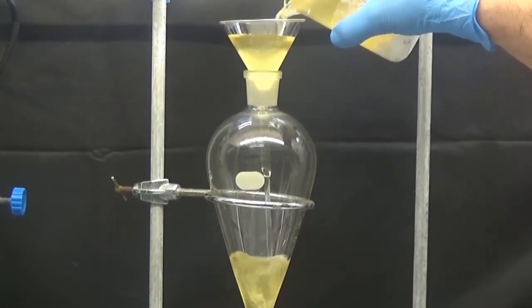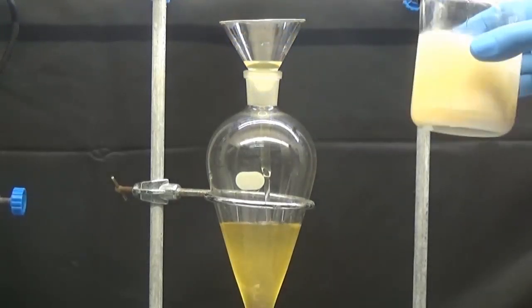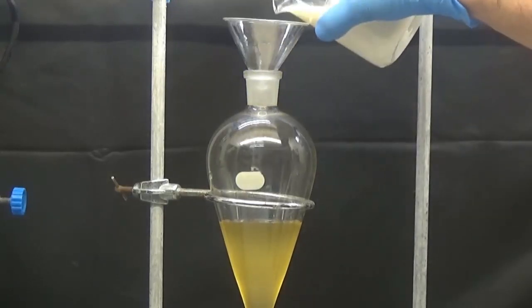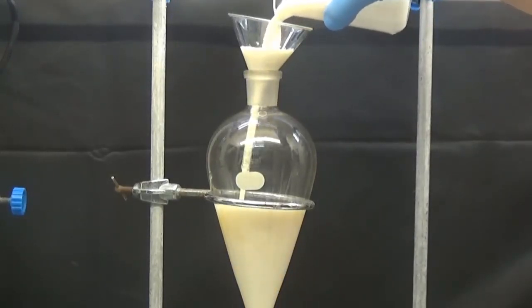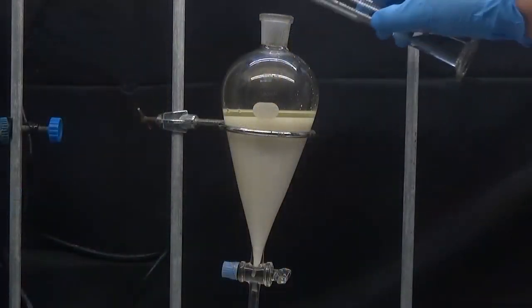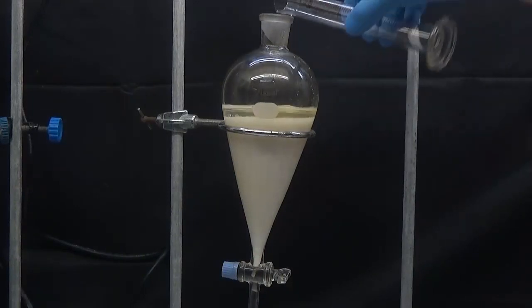We put the result in a separatory funnel, including the white precipitate. Wash two times with 50 milliliters of cyclohexane.